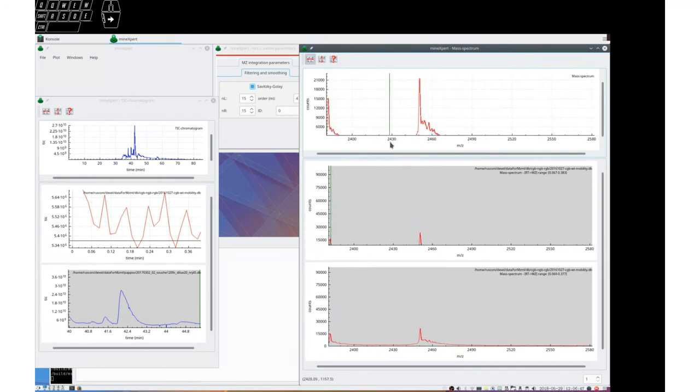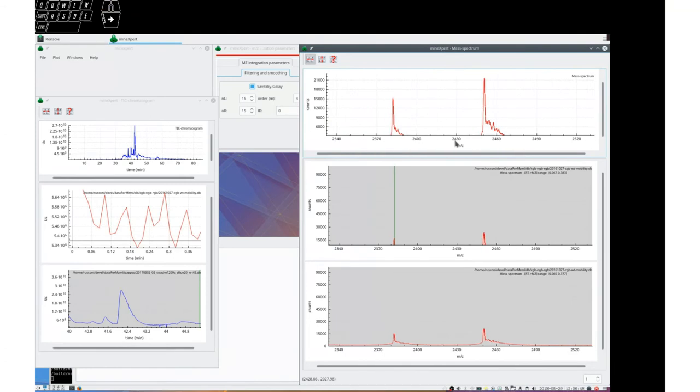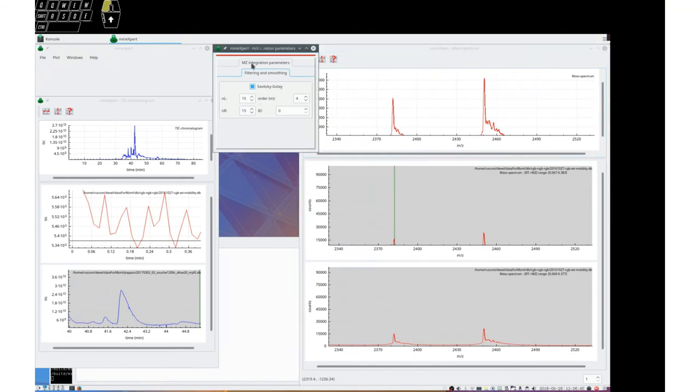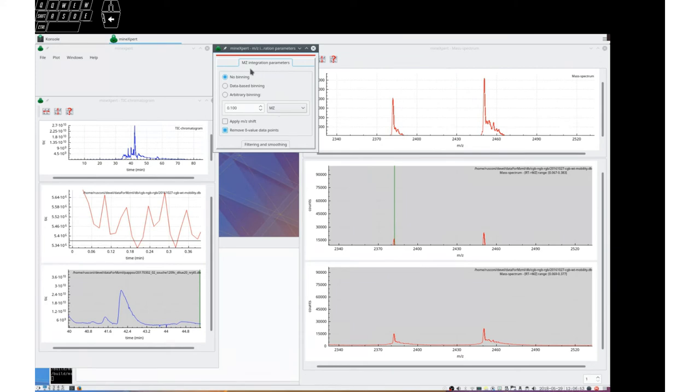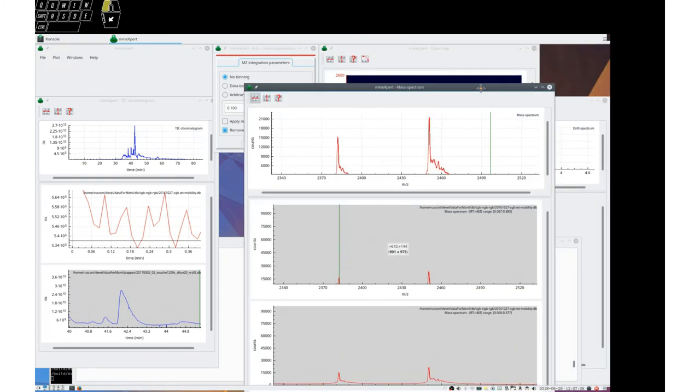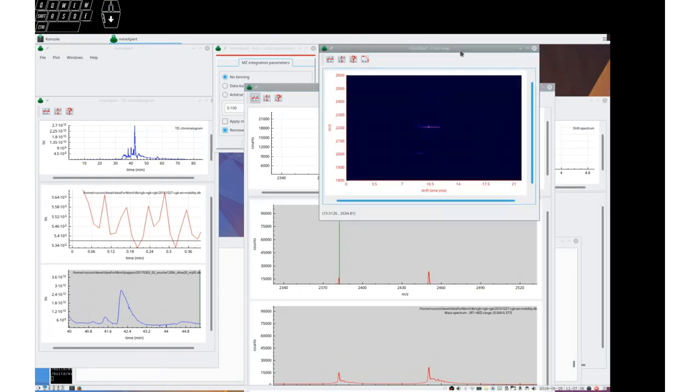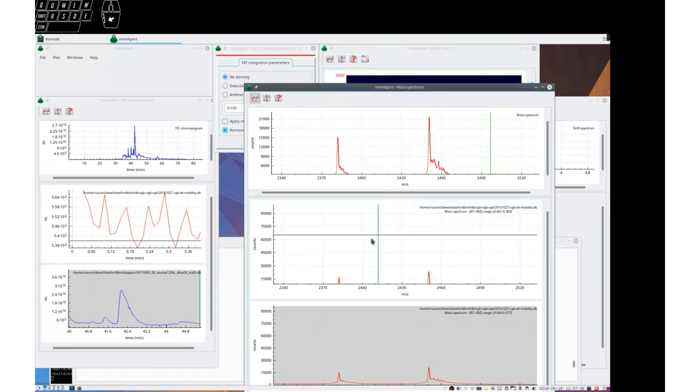So as you can see, this dialog box here allows you to pretty well configure the mass spectrometry data integration from tick chromatogram or color map to a mass spectrum.